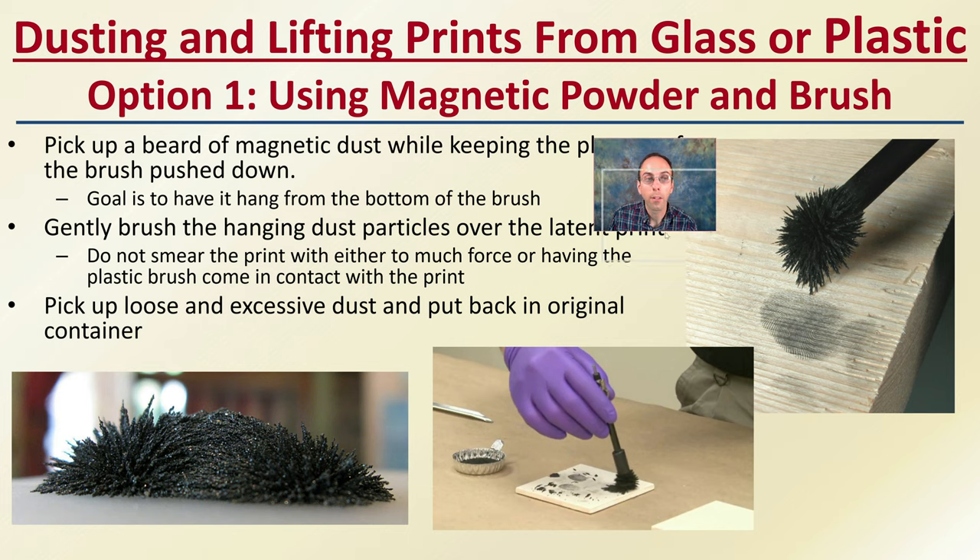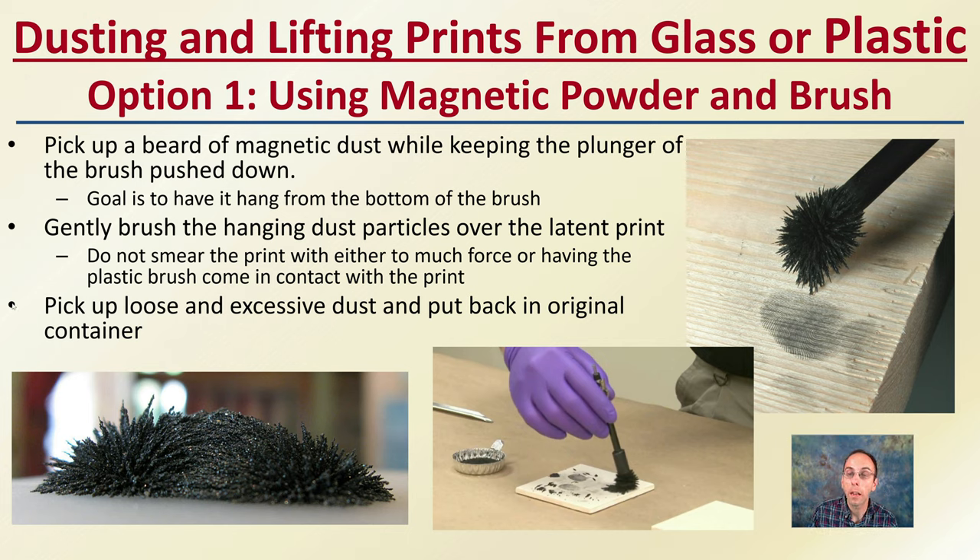For dusting and lifting prints on glass or plastic, option one is to use magnetic powder and a brush. Pick up what's called a beard of magnetic dust — this little area here does look like a beard. Dust while keeping the plunger of the brush pushed down. The goal is to have the dust hang from the bottom of the brush, as we see demonstrated here. Gently brush the hanging dust particles over the latent print. You don't want to smear the print or apply too much pressure. If you have too much force or the brush contacts the print, you'll damage it. Pick up any loose and excessive dust and put it back in the original container — it takes very little dust to accomplish this.